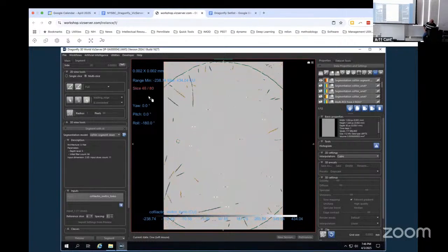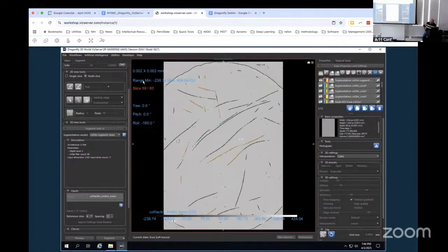Right? So here we go. This is the cleaned up network. Hopefully you can appreciate all those little spots are just gone. It is still finding some of the carbon. We could add some carbon to our training set and really hammer that out, but we added a fiducial fold, and so it's missing all of the fiducials as well now, or it's ignoring them. But that's the basic premise of retraining.